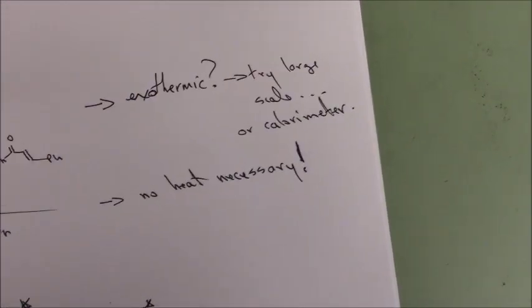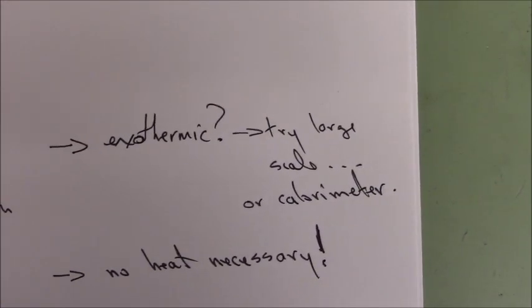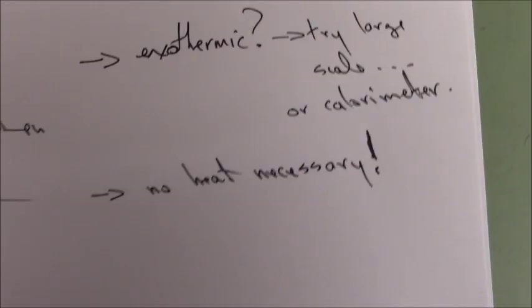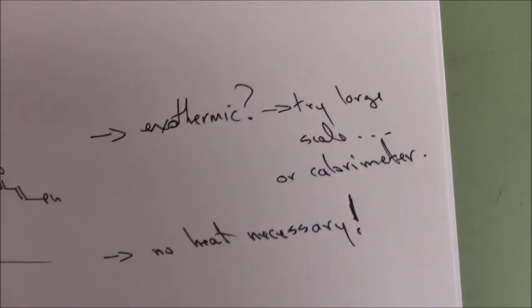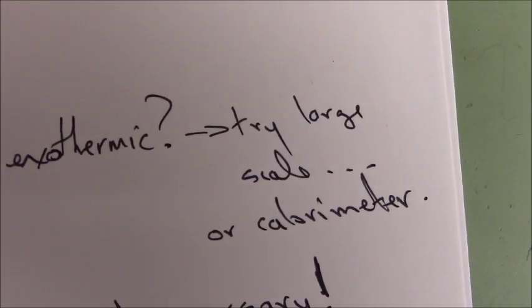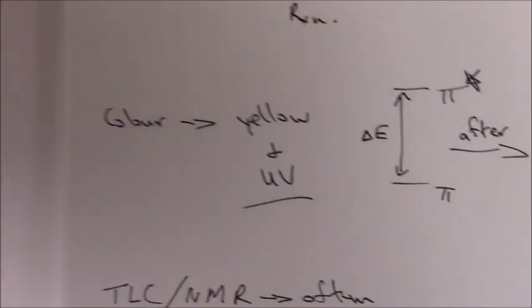So discussion, is this exothermic or not? We don't notice it heating up in particular, but we let it stir for 3 hours, and it gets done. We don't have to heat it, so I would argue that overall, it's not obviously exothermic or endothermic, but if we tried it on a large scale, we might see heat coming out or it getting cooler, or we could just do it in a calorimeter.